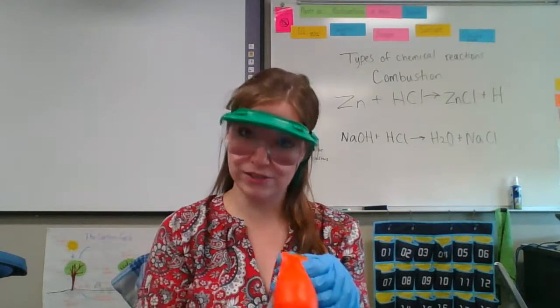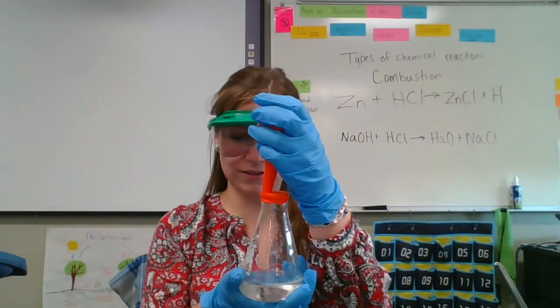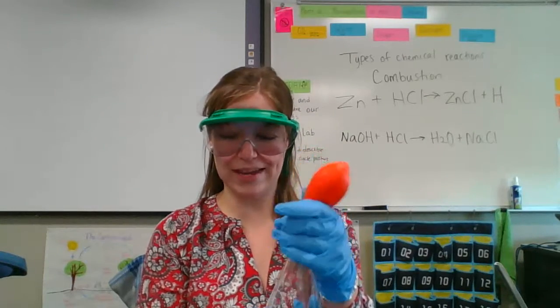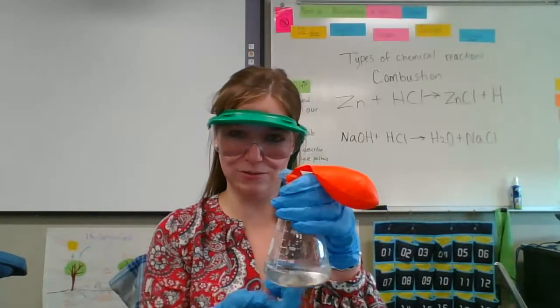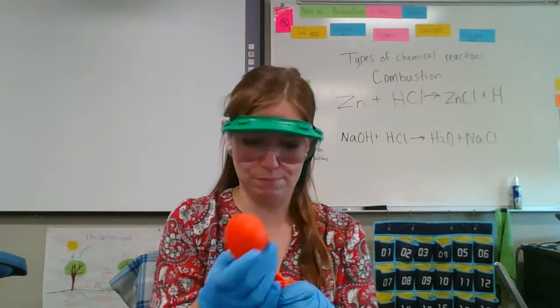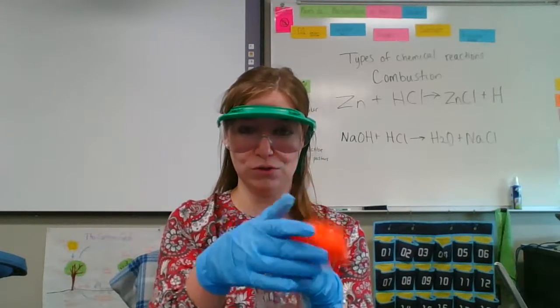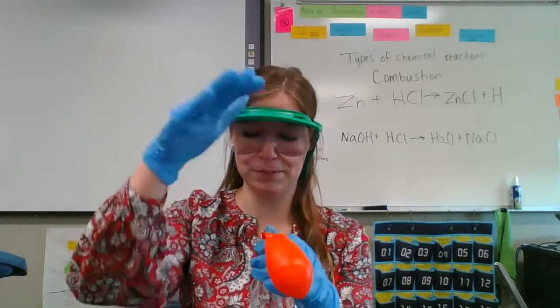Okay, so this is what happens when our acid is too diluted. Basically, I'll try to see if I can get a better example of this later, but this balloon is filling up with a little bit of gas, but not a whole lot, because most of this hydrochloric acid has been used up already. And so the zinc is just forming in a pile at the bottom. What we should have seen is that as it made hydrogen gas, it should have bubbled, blew up this balloon pretty big. The other ones in classes were like about this tall. So not the full size, but pretty big.